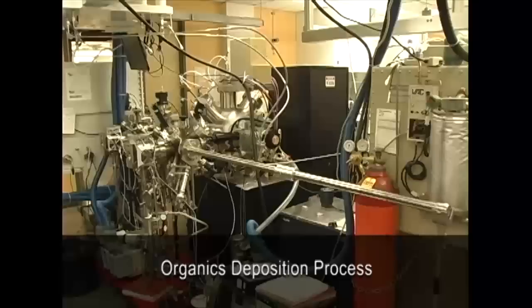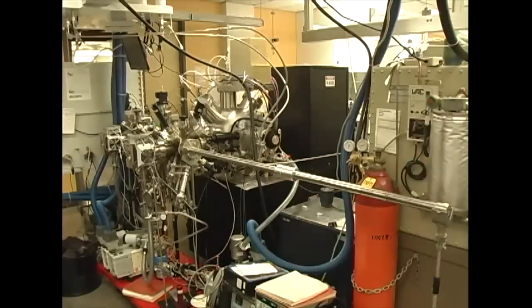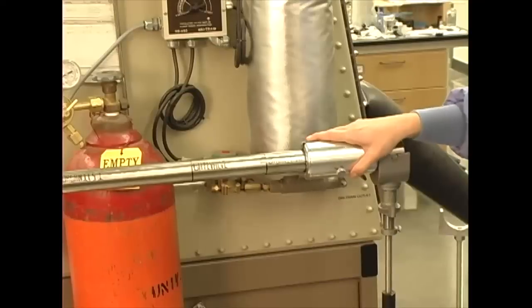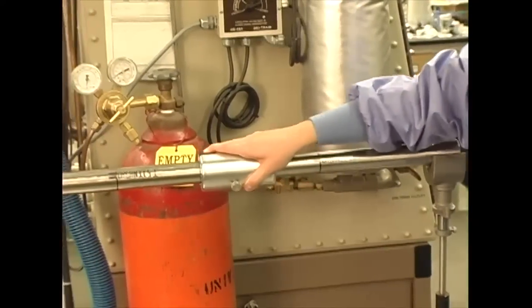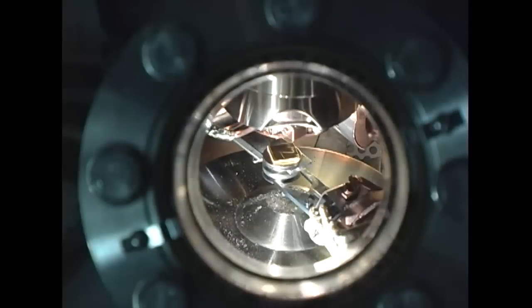After a vacuum of 5 times 10 to the minus 7 torr is achieved and the organic source has reached the desired temperature, we start the deposition process. We move the arm with the boat into the organics chamber and rotate downwards facing the organic crucibles.